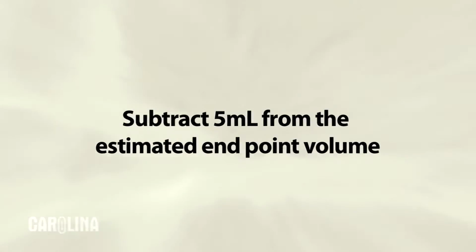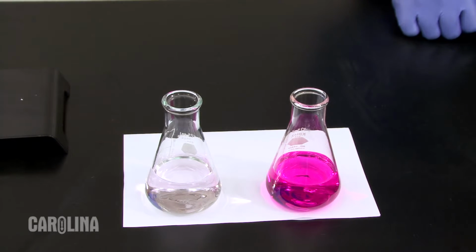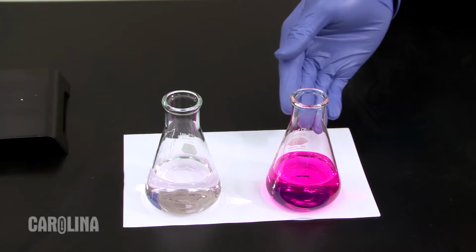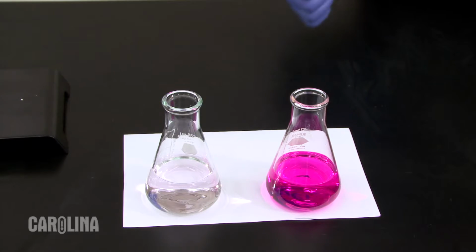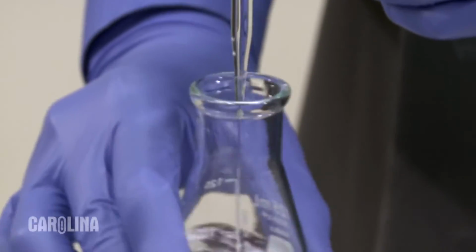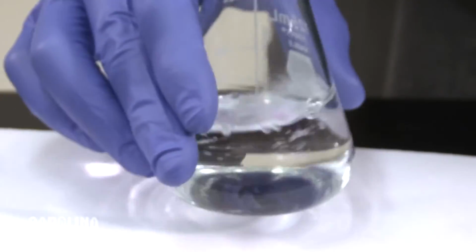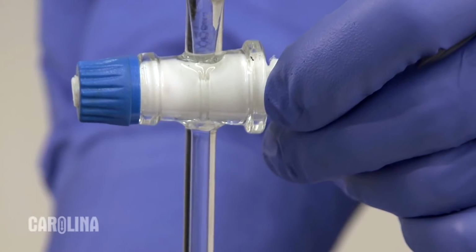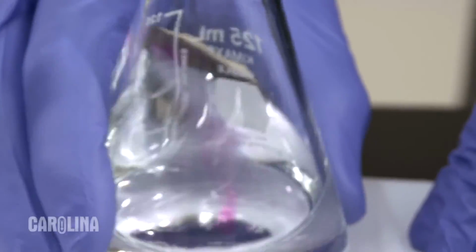Knowing the volume that is a little past the endpoint, subtract 5 milliliters from that number to get the amount of titrant that can be safely added before a slower addition is required. As the estimate titration shows, a dark-colored solution indicates an excess of titrant has been added. The desired endpoint is a pale, faintly colored analyte. To reduce the risk of passing the endpoint, slow down the addition of titrant when flashes of color begin to appear in the analyte. Adjust the stopcock to slow the flow of titrant to a dropwise rate.